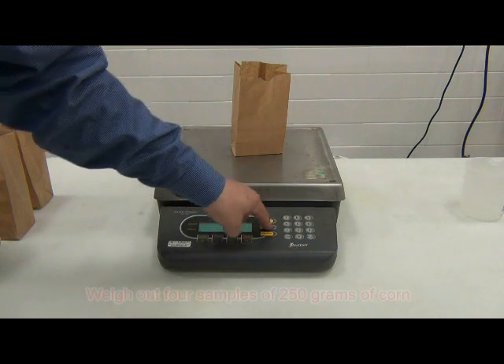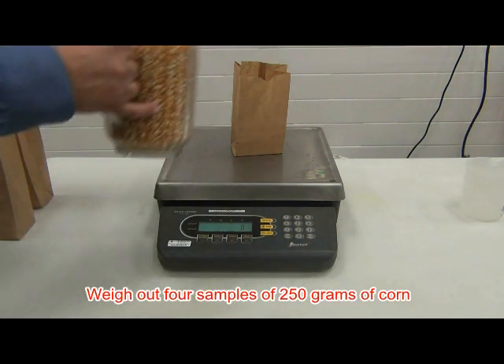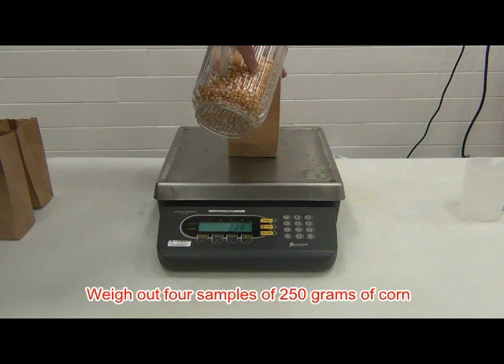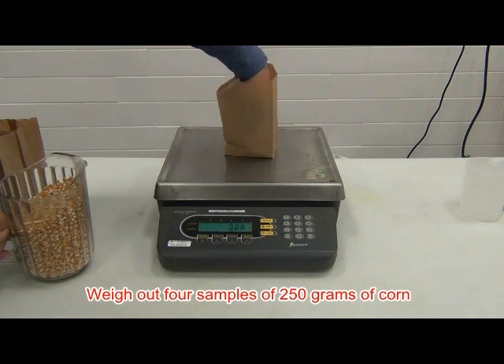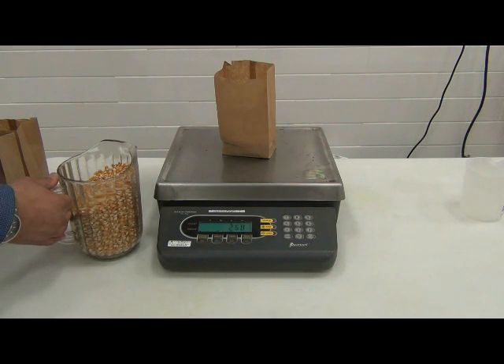First, we will need to weigh out four samples of 250 grams of corn. Label one sample as a warm-up sample. The warm-up sample will be popped in the MWVT and used to stabilize the kettle temperatures — the popcorn will be discarded. The three remaining samples will be used for the expansion test and the results will be recorded.